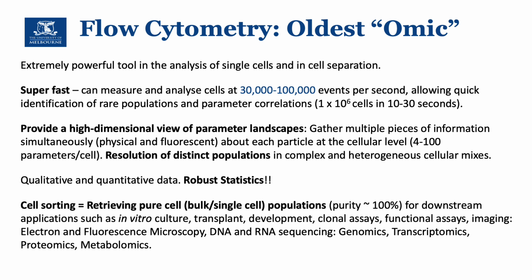And the other thing that is very important in cytometry, which makes the technique still relevant today, is the fastest way to isolate these specific populations based on the properties measured above, and get pure or bulk single cell isolations that are important as a necessary step before other applications like advanced fluorescence microscopy, sequencing, proteomics, metabolomics, you name it.